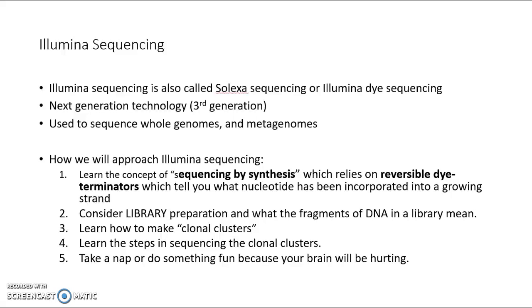Then we're going to talk about library preparation and what the fragments of DNA within a library mean and what they look like. And we're going to then move on to talking about how to make clonal clusters and then look at the steps in sequencing the clonal clusters. And then you're going to need to take a nap or do something really fun because your brain's going to be hurting after you learn all about this really cool technology.